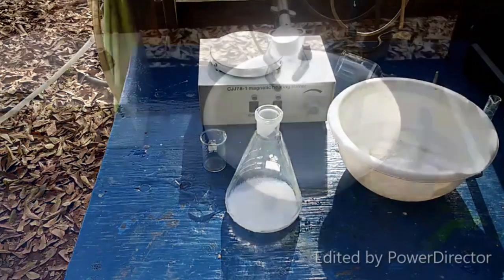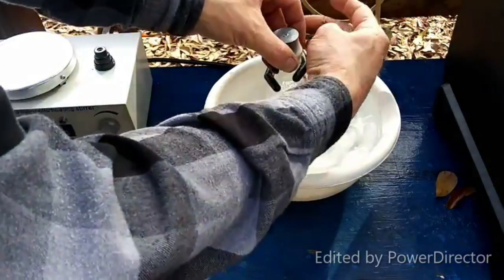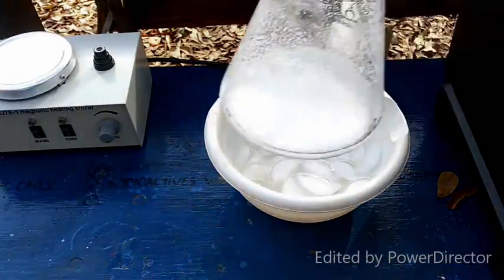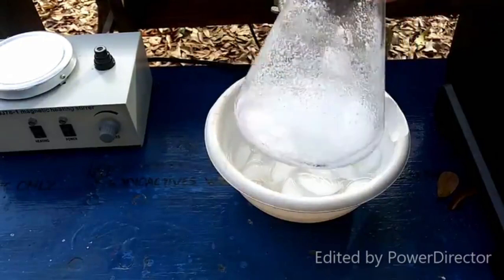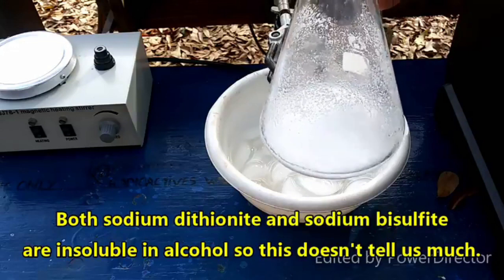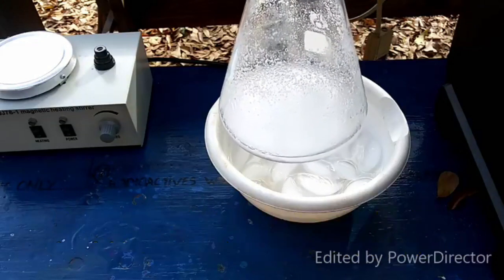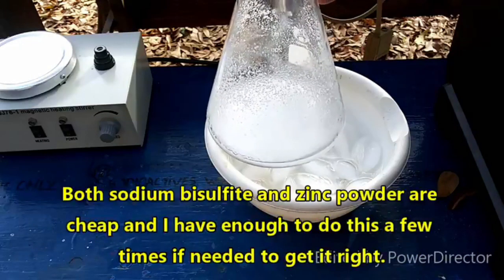I've had this mixture cooling on ice for a little more than an hour. It did not take long for everything to precipitate out — this is what we've got: a whole lot of white solid. I'm going to go ahead and filter this off and wash it with a little anhydrous ethanol. This is just a practice run, so I'm not really going to do anything with this batch.